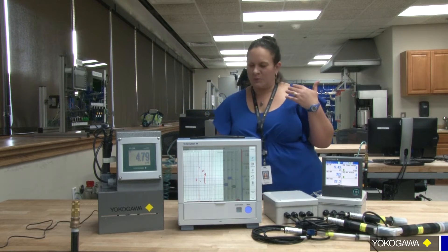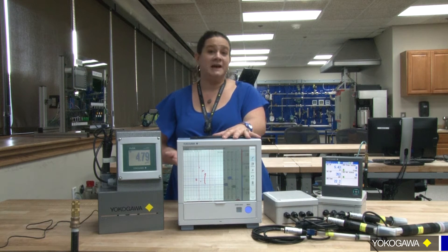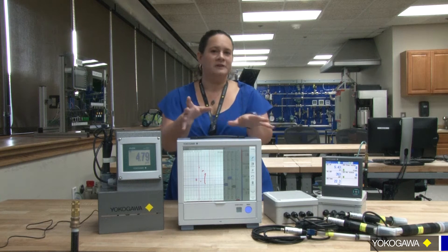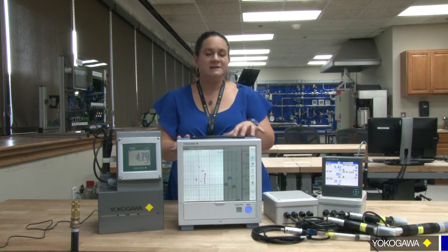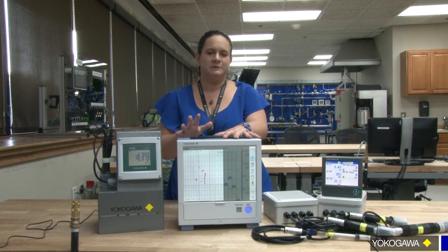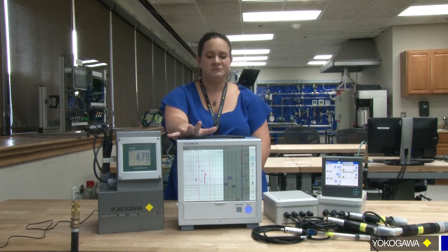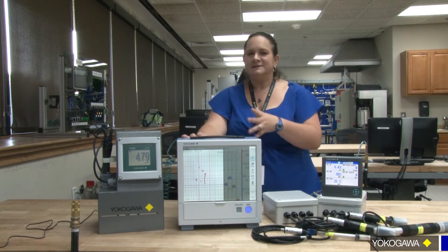Again, the FX and the GX have multiple different features. I don't work for our recorder division, so I can't show you all the extra bells and whistles, but I know there are a lot of other features in there. You can take in more than just a pH or a p-sensor — you can take any other device that has a signal coming into it. So if you already have one or if you need to record your data anyway, they're a great feature.